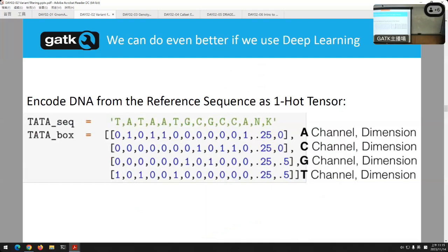So tensors are the data structure used for deep learning. What we're going to do is represent the genome. We're going to traverse the genome and model it and try to find out where errors occur. What are errorful sites, and what types of structure lead to SNPs? We can do this much more powerfully with deep learning.